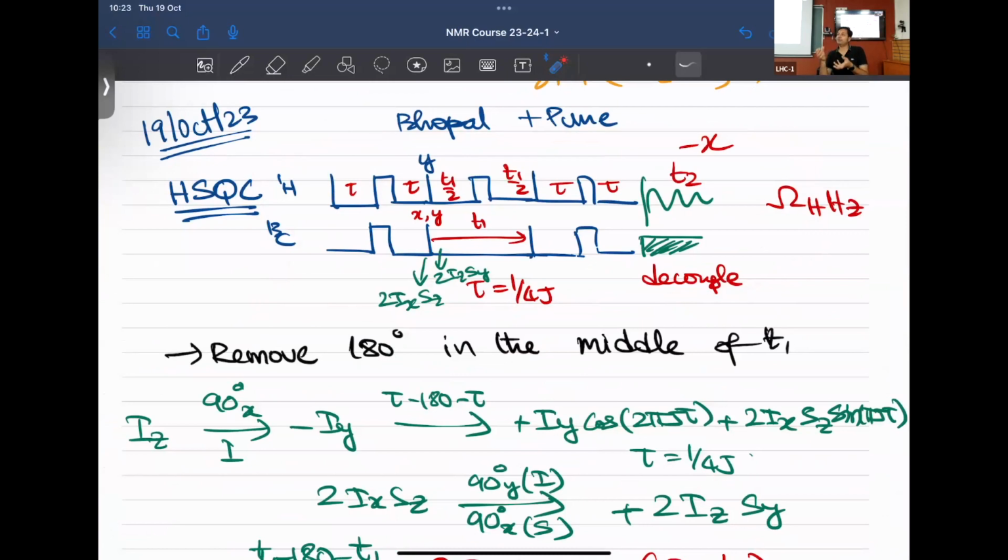On the other hand, you can always correlate proton to proton also. What benefit we get, we will see a little later, tomorrow. Those experiments are also important. But I just wanted to show you how Fourier transform helps. We have been talking about it so much. We'll take a look at the 1D experiment, do a Fourier transformation, then look at how the 2D helps get frequency from the indirect dimension. I gave you an idea of what an interferogram is. Let's take a real example and see how it actually comes out. That will be the focus of today's class.